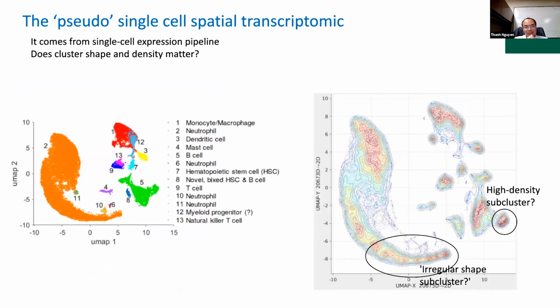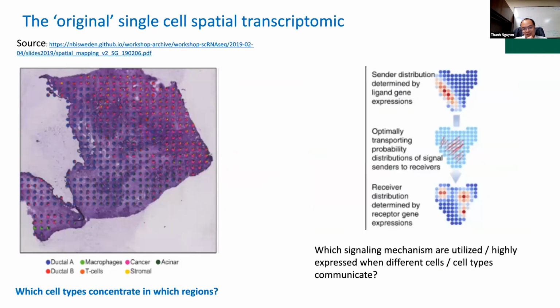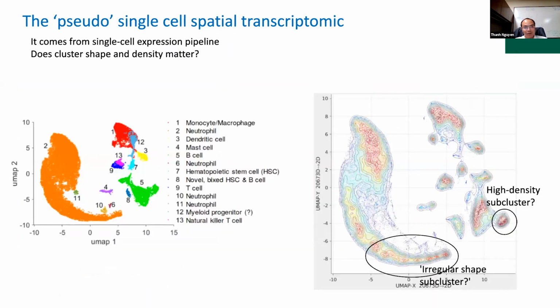Now, in case we don't have the funding to do such expensive operations, in our institute we try to make things simpler, and we ask ourselves, can we really use the clustering, including the embedding, to map the locations of the cells in the embedding space instead of the tissue image?